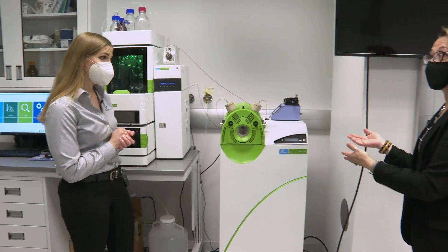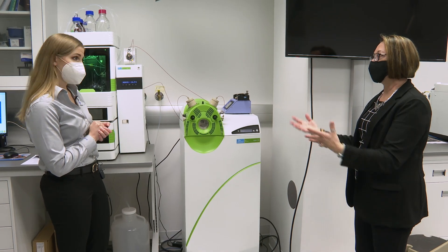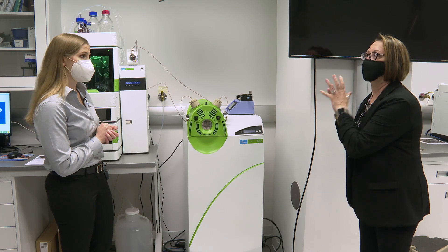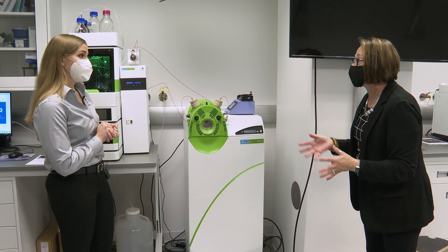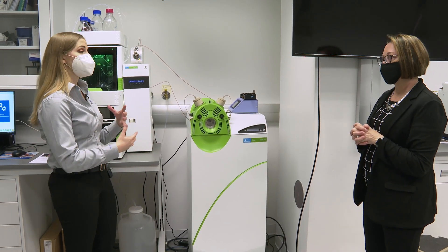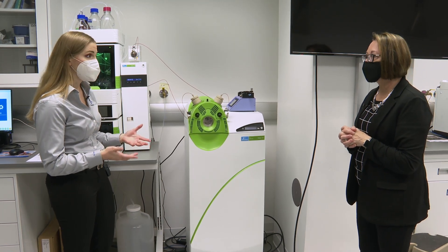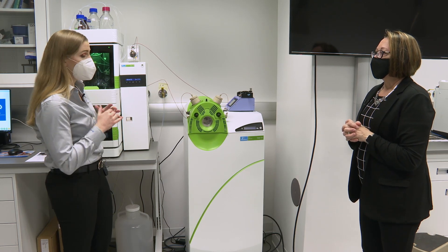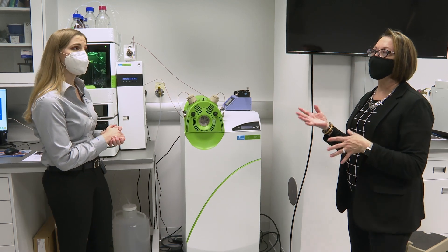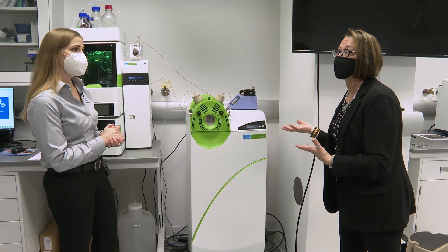Basically it saves you time, because with a standard LC-MS you would have to do some sort of sample prep to get to a point where you could actually use a mass spec on it. The Q-Sight can save you loads of time and money in consumables — you may be able to avoid things like cartridges or solid phase extraction. You can certainly still do those offline, but you may not need them with this instrument. PFAS and PFOS are some of those things in environmental testing that are being regulated now by many states.